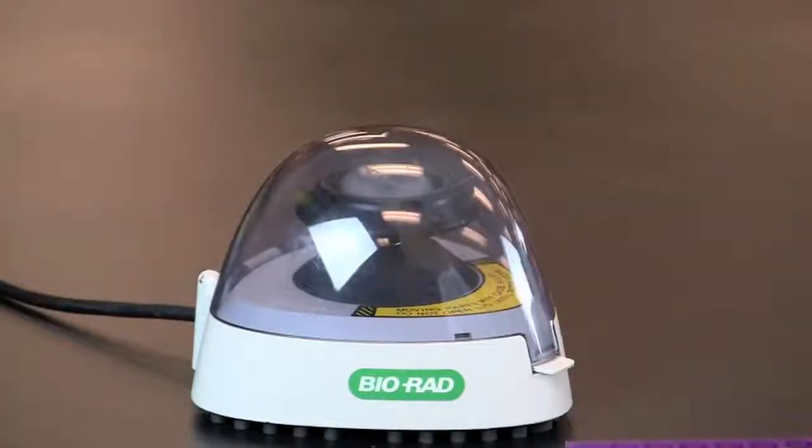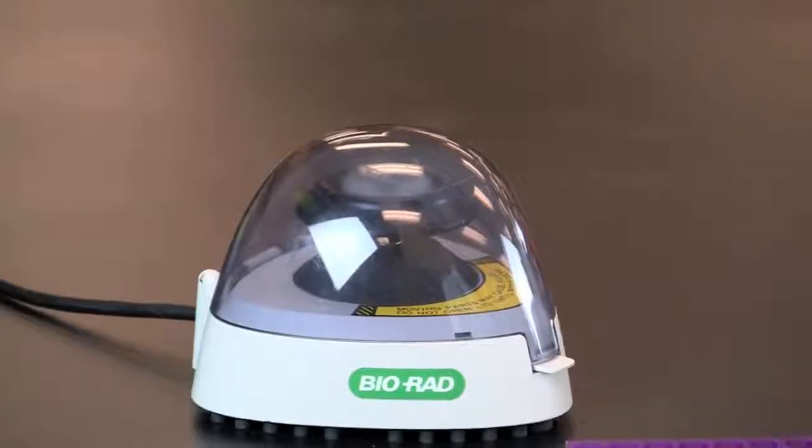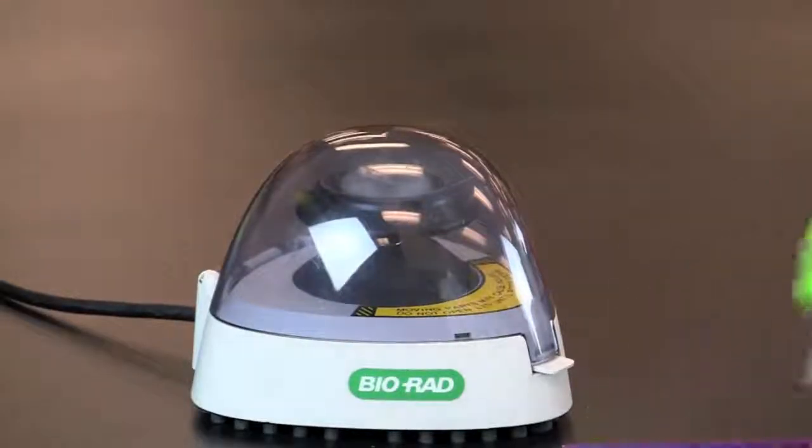Place the tubes into the microcentrifuge in a balanced configuration. Centrifuge at top speed for 5 minutes. If using a mini centrifuge that can only reach 2000 g's, centrifuge for 10 minutes.